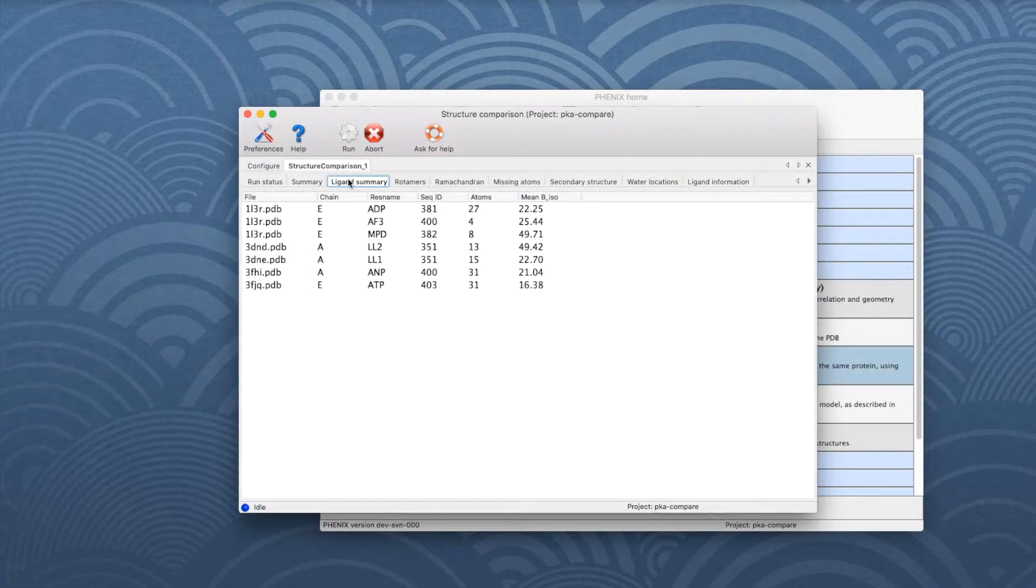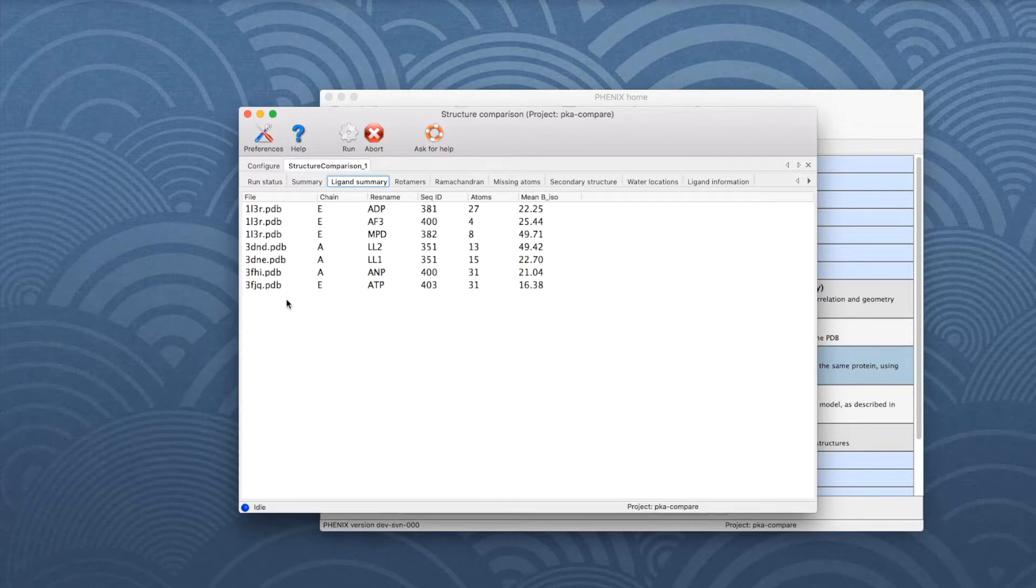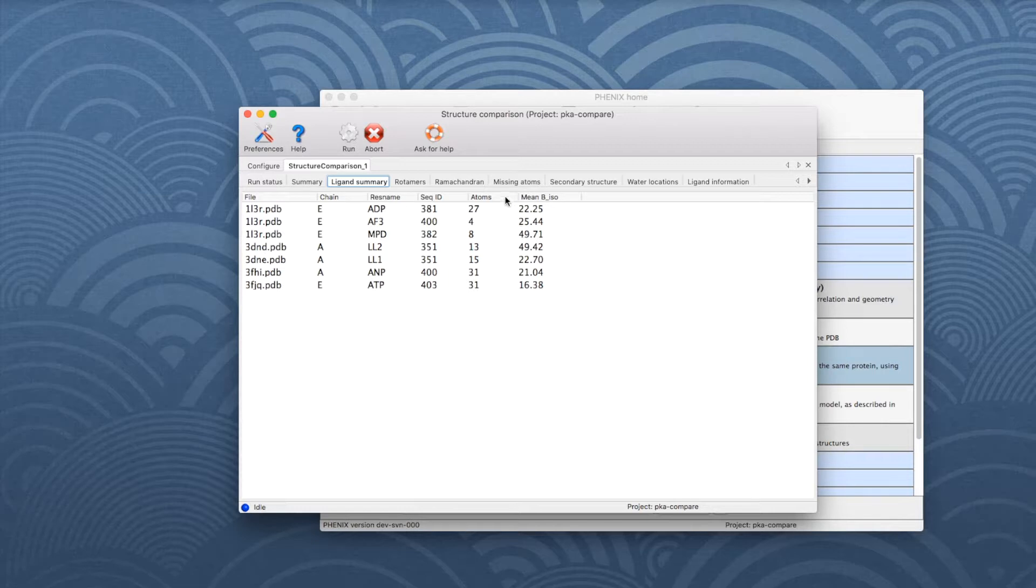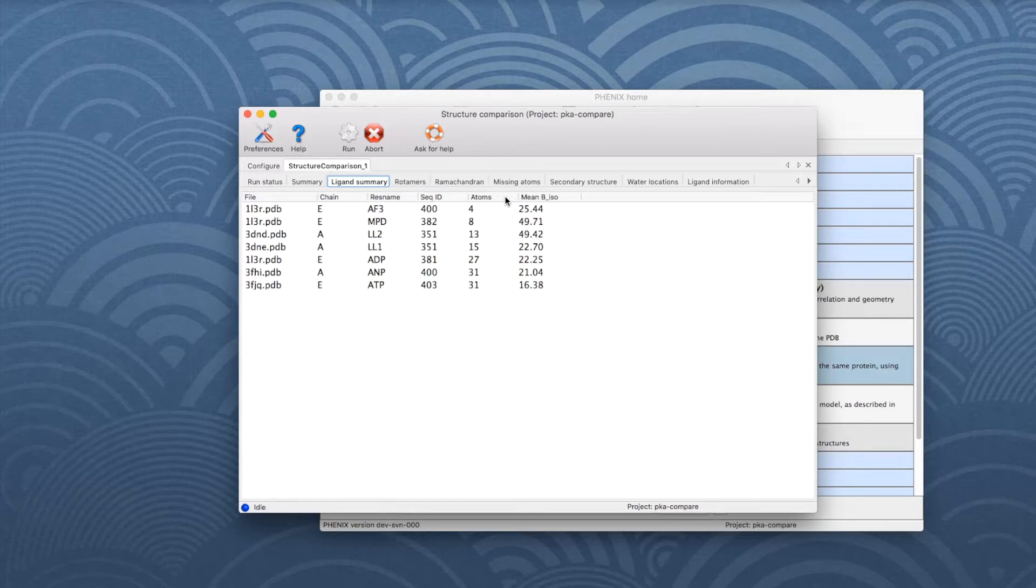The Ligand Summary tab lists similar properties for all ligands present in the chains to be compared. Note that columns are sortable. The items in the table can be, for example, sorted according to the number of atoms.